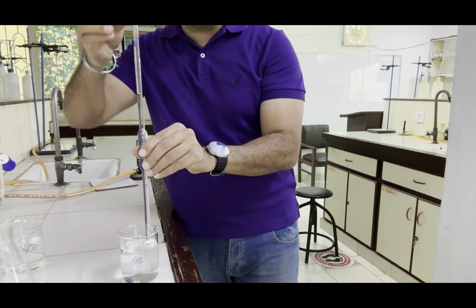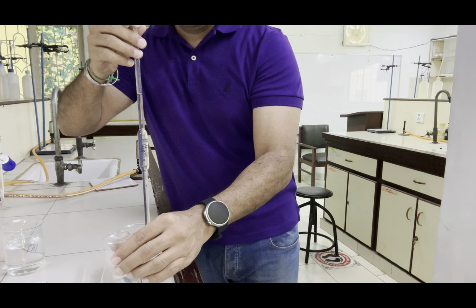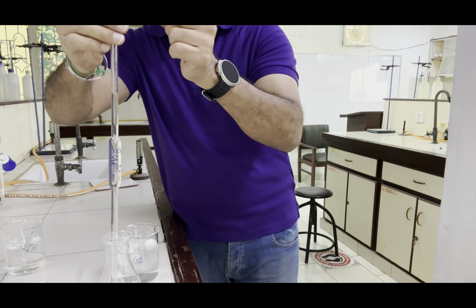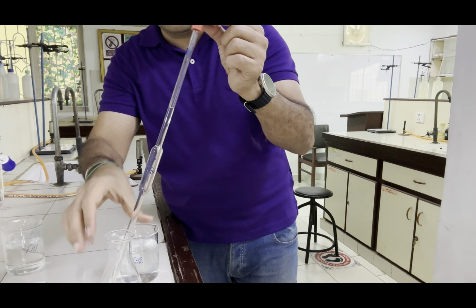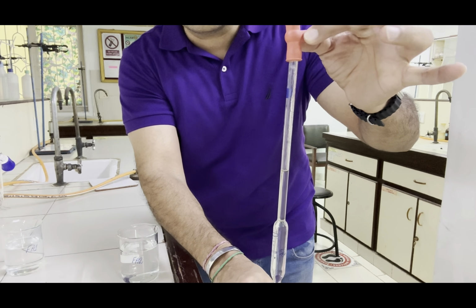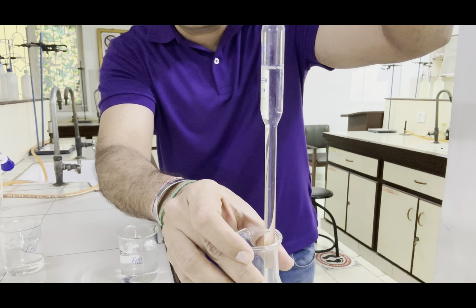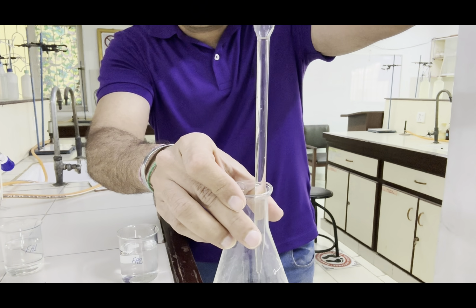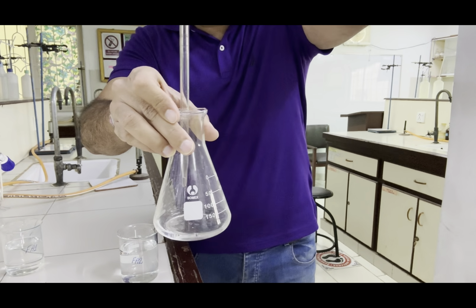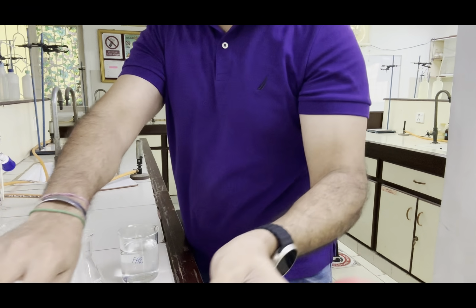Then I will transfer this content into this conical flask. So I have taken out the solution and I will press this E button now, which is here. You can see this E button. I will press this E button and this solution will start draining. You can see the solution is going into this flask. In this way we have transferred our Fa2, 25 centimeter cube, into the flask.